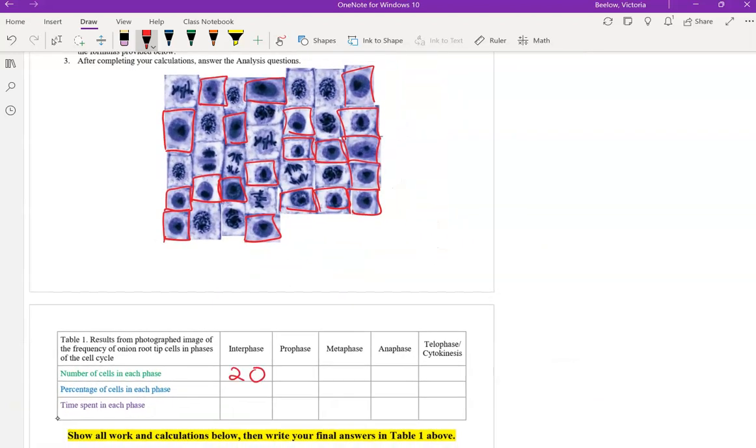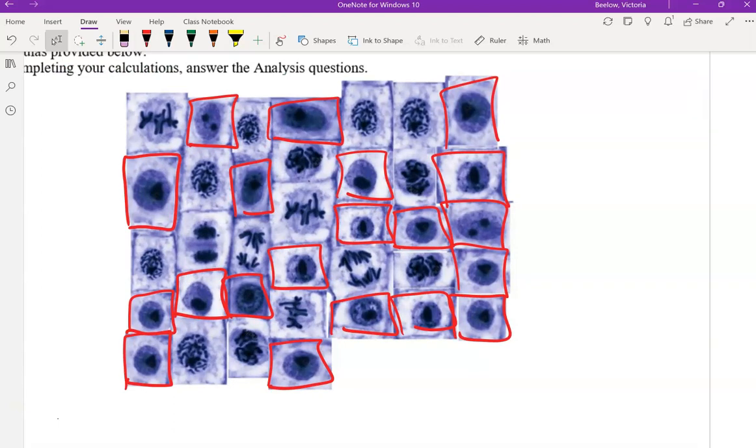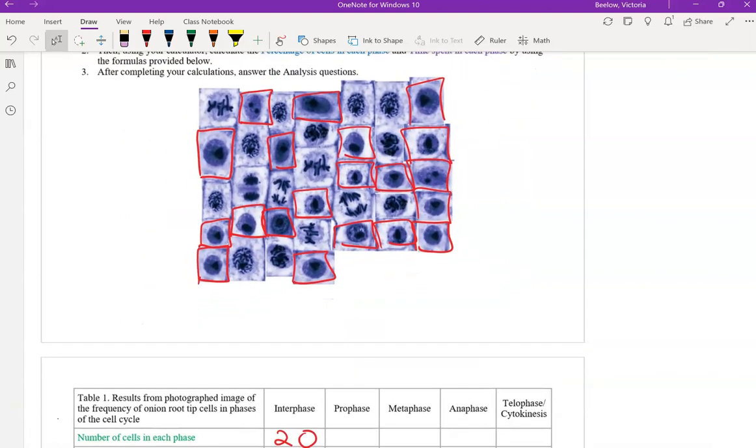Now, when you're looking under a microscope, it's real life. These images aren't going to be totally clear. So for part 2, when you're looking at your image from the microscope, just count the ones that you can identify. Even looking at some of these, they don't all look the same, and that's okay. Sometimes that can make it a little hard to distinguish what's what.